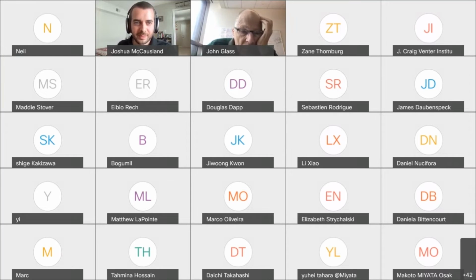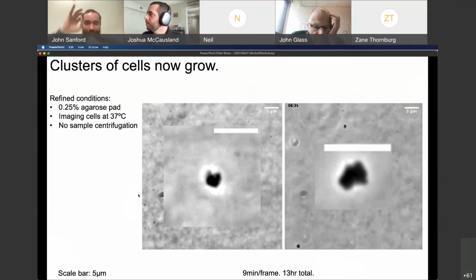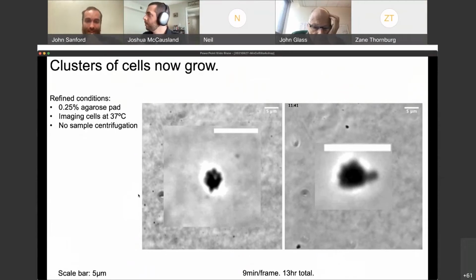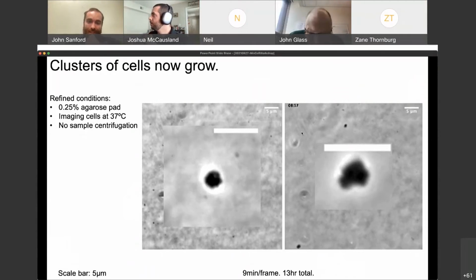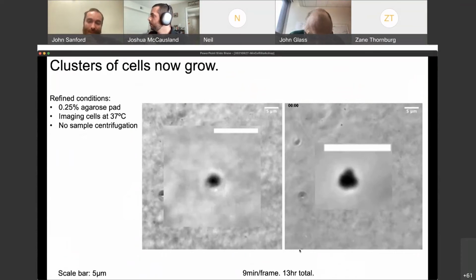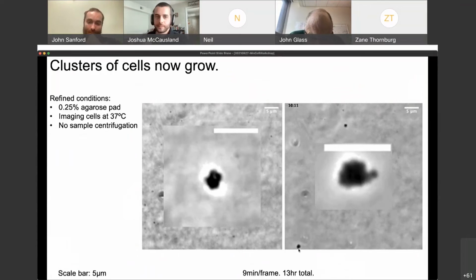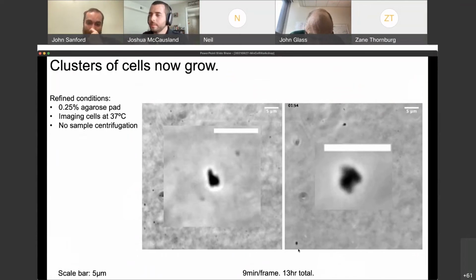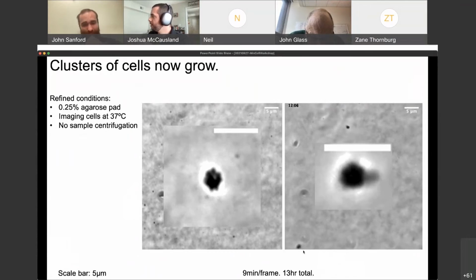A quick question. I saw on the slides you had before, you were showing your mCherry technique. I know this is probably not what it is, but I was just really interested. Below the timestamp on your right slide, they look really similar to mycoplasma colonies when you look at them under an optical microscope, like the one directly to the left of that zoom in right there. Do you know what those objects are?